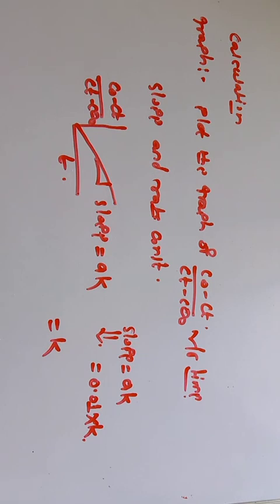So this is all about the hydrolysis of ethyl acetate by NaOH using conductometry. By volumetry we already performed this experiment in SYBSc. With the help of conductometry we perform this experiment in MSc first.